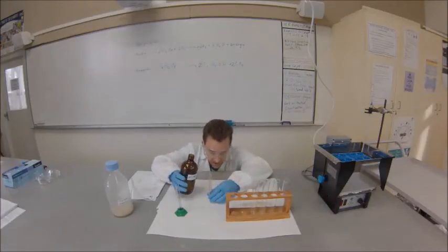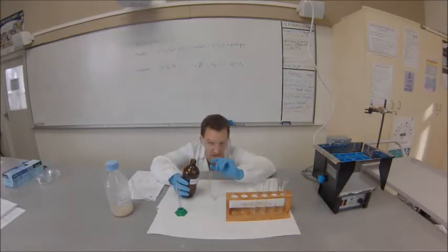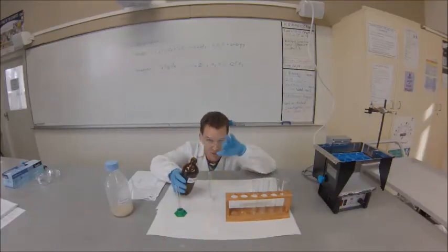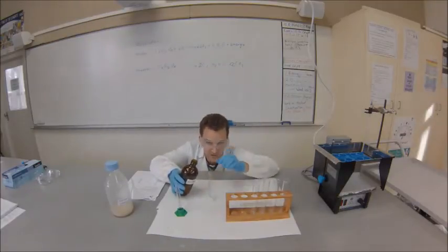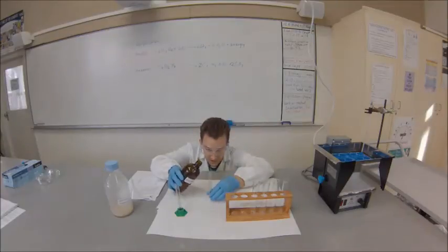When measuring, get the measurement mark at eye level. We want the bottom of the meniscus - that curved top of the solution - to be level with the 10ml mark. Carefully measure that out.